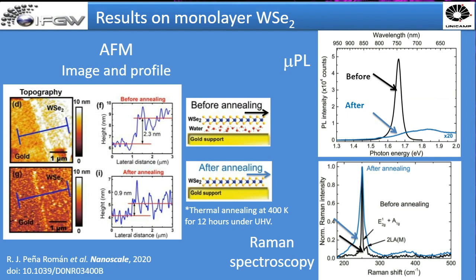Okay, so the moire effect is really linked to the existence of two similar patterns, like the TMD on one side, or the hBN, and its underlying support, which should have some similar ordering. But the gold we used here was not a reconstructed single crystal. That would be hard to preserve in air for the transfer.